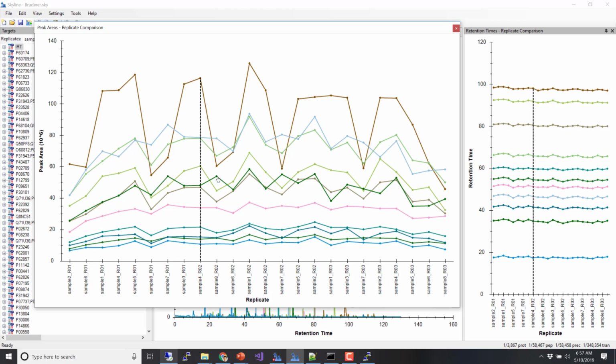It's not repeated 2, 6, 1. It's actually, when we get out to R2, it's 4, 8, 6, 1. And it's possible. I know that Olga told me she consulted on one of these papers and forced them to do randomization, go back and recollect the data randomized.